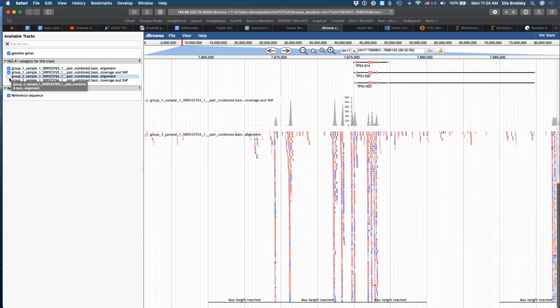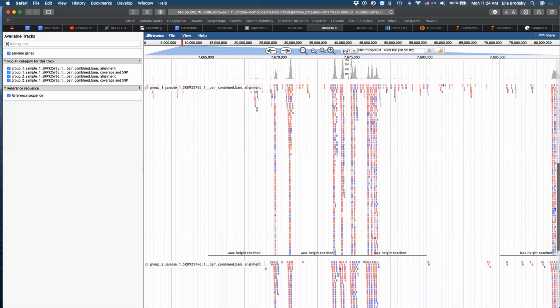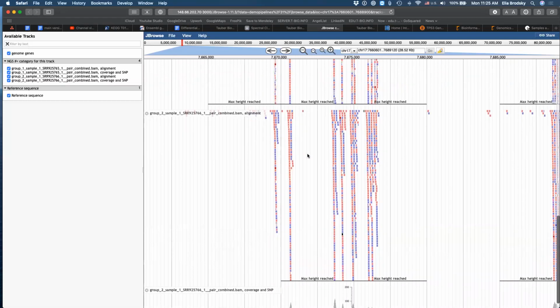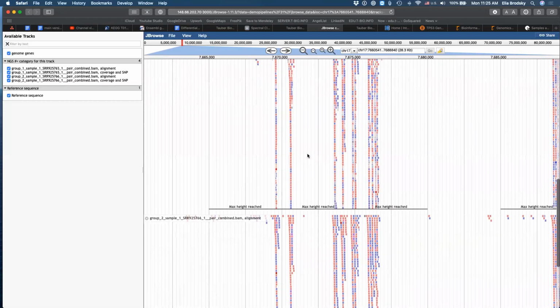So now we can click on these and visualize them. And you will see that there's a whole different story for the germline mutations. And we're not going to wait for this to load, because now you can see why we talked about big data last time. Well, because this is a lot of information. This is just one of the genes, right? This is the region that we're looking at, just on one of the chromosomes and not even the longest one. And there are so many different comparisons that we have to make to essentially be able to extract some kind of meaningful information from here.